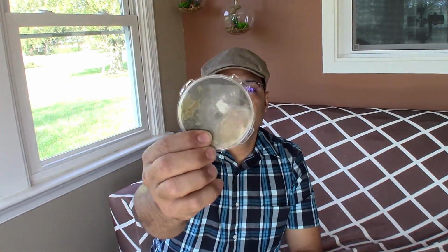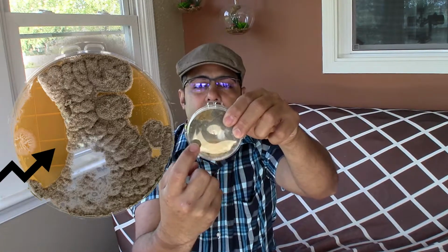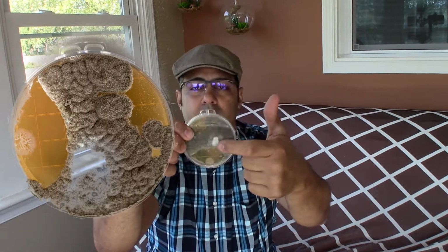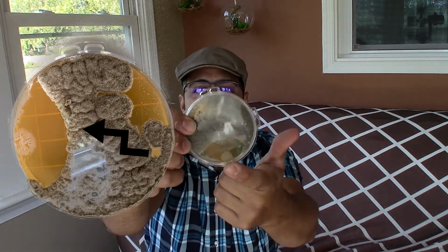Now in this case, that didn't happen. It's not growing in a circle. Here you can see there's a concave area, convex with respect to this contaminant but concave with respect to this other one that is here. When I saw that, I said, well, this is definitely yeast. It could be bacteria, but it's definitely a yeast.